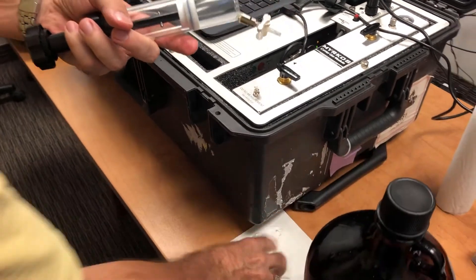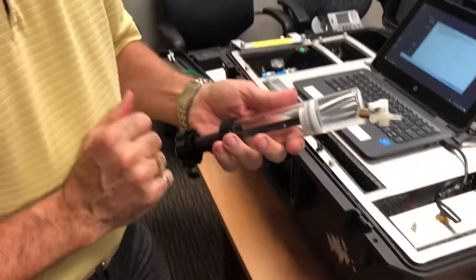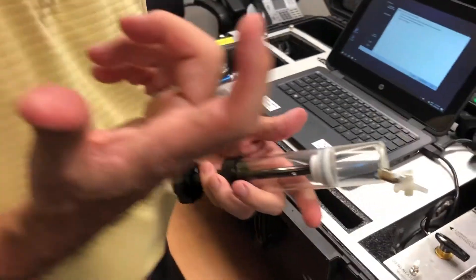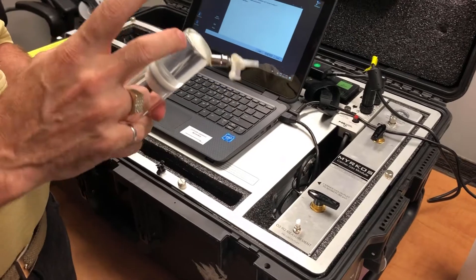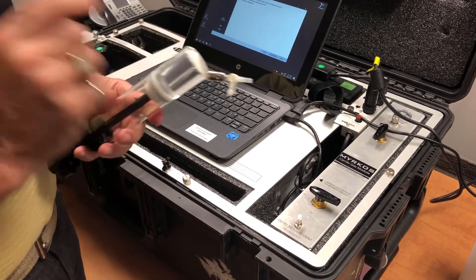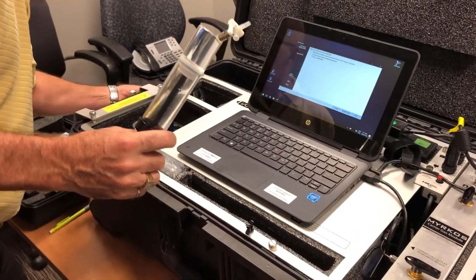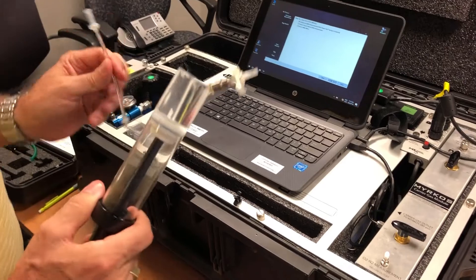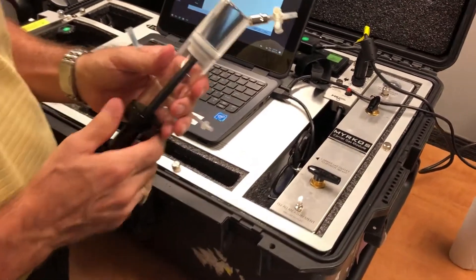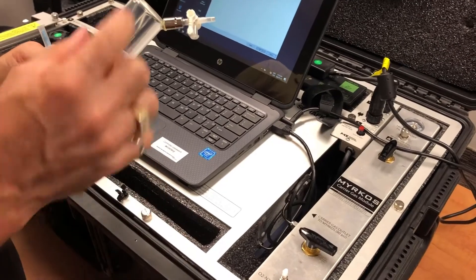And we need to create again a headspace. Now we cannot use air. If we use air, we're going to bring a lot of oxygen and nitrogen, and we will contaminate the result. So what we do is we use helium. We use helium into the helium cylinder to create a headspace.